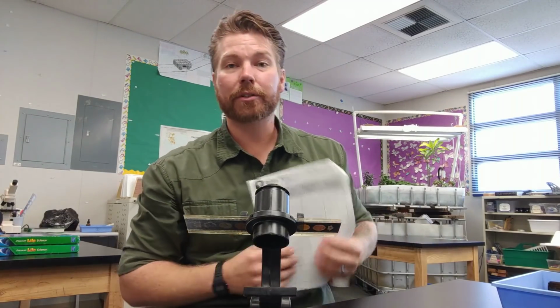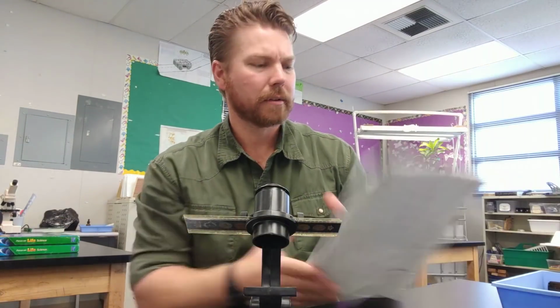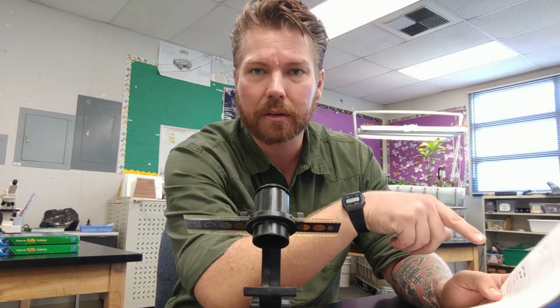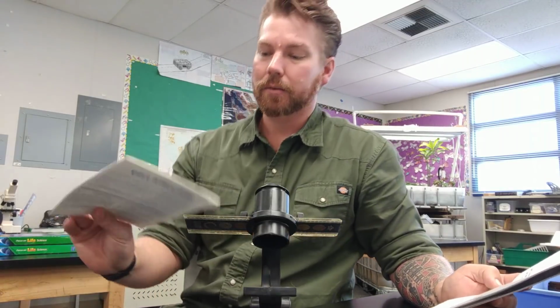So what I want you to look at is the cheek cell, which is number 4, the blood cell, which is number 5, the nerve cell, which is number 6, and bacteria, which is number 7. Again, you can get information about each one from here as well.